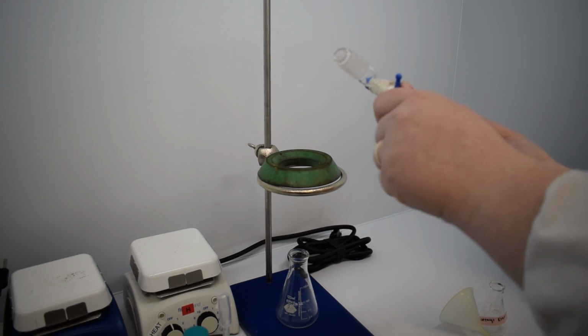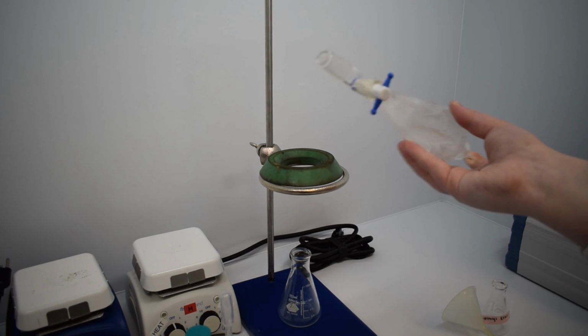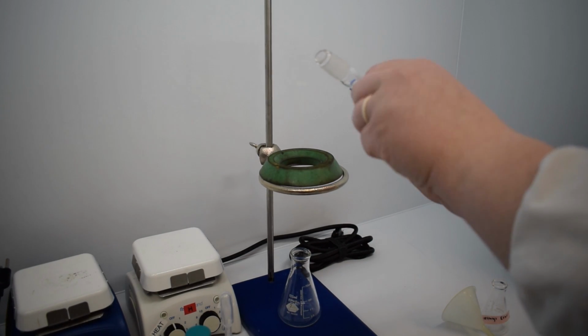As that pop sound gets quieter, you can start to shake the separatory funnel a little bit more aggressively. Once you can't hear that sound at all each time you vent, that's when you know that you can stop the venting process and replace the separatory funnel in the iron ring.